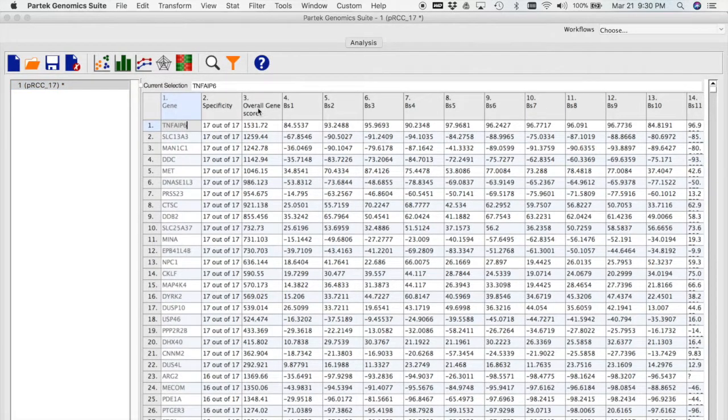So now that we have all the metadata in Partek, we're going to want to format it even further. Most of these analytical programs have a preferred way they like to have the data presented to them. Partek works better when all of the samples are in rows and the genes are in columns. In this case, we have the opposite. All our genes are in our rows and all the biosets, our comparisons, are in our columns. So we're going to want to reverse that.